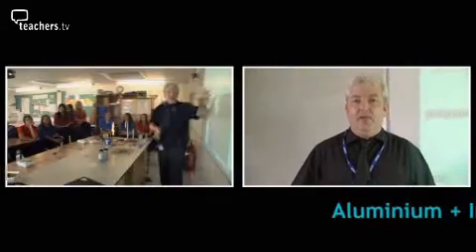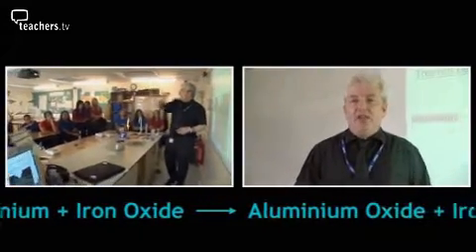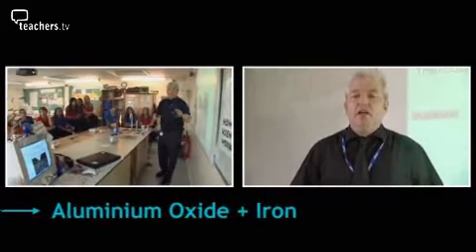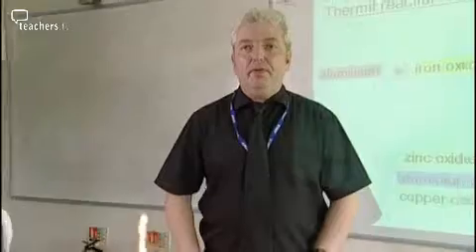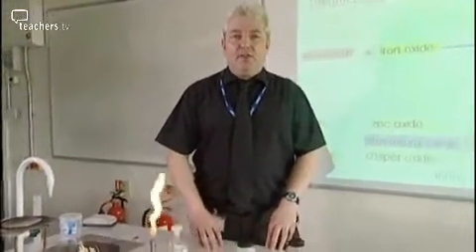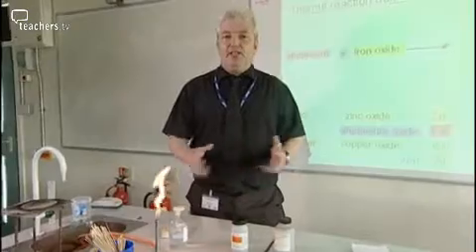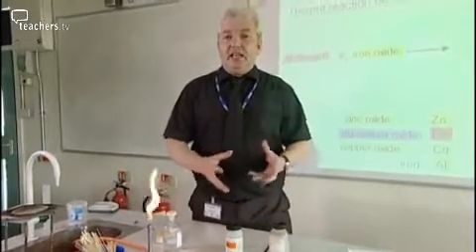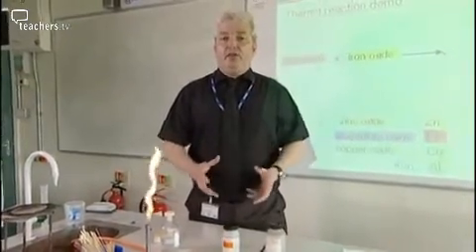Today we're going to do a safe version of the Thermit reaction. The classic Thermit reaction between iron oxide and aluminium is a reaction that's done many times in schools. But because of its inherent dangers, it's not something that you can get students to do. Today I'm going to do a type of Thermit reaction which students can do. Still has all the same excitement and enjoyment. They still get to see the massive amounts of heat that's produced, but it's in a completely safe and contained way.